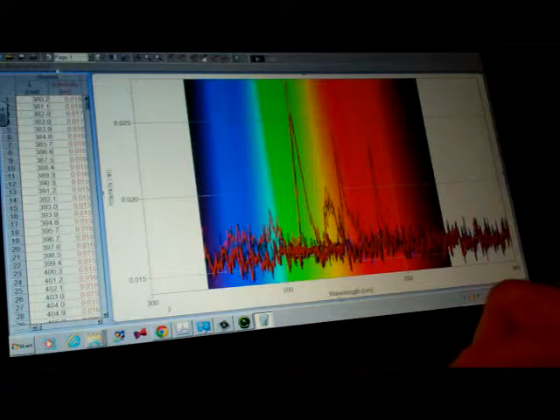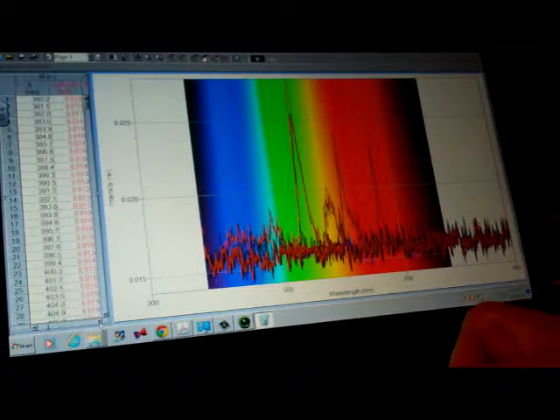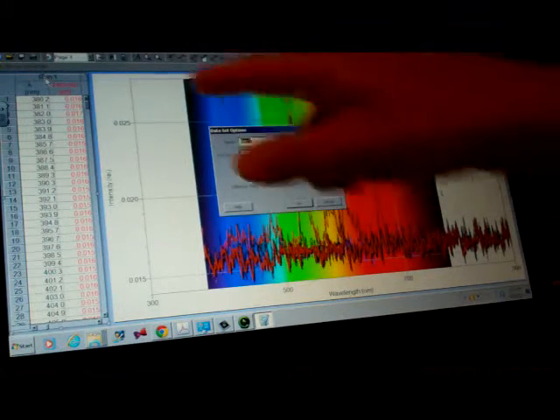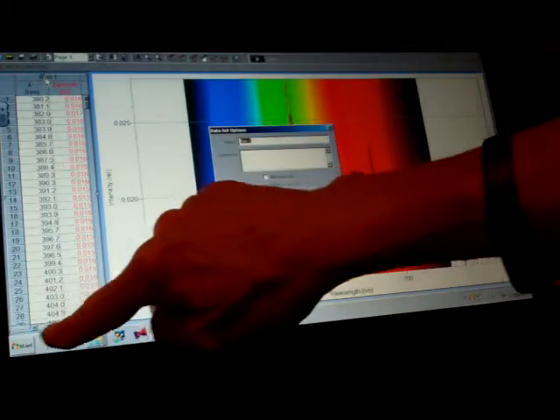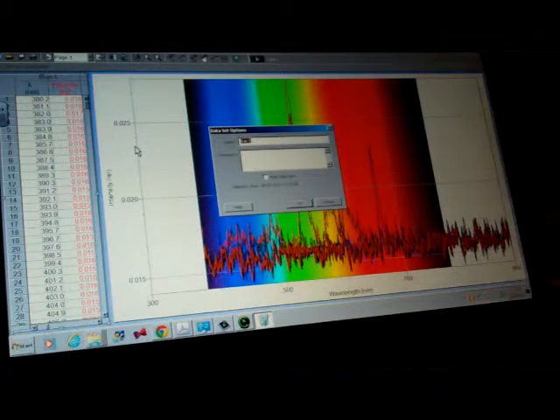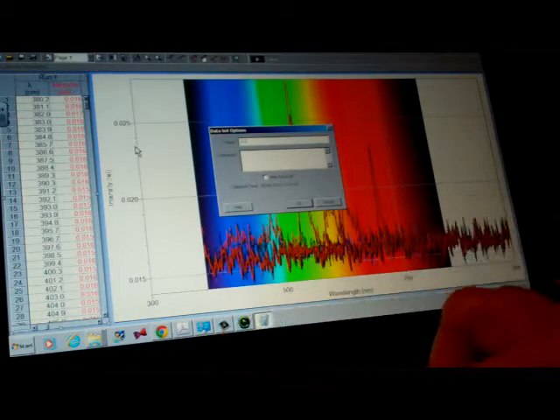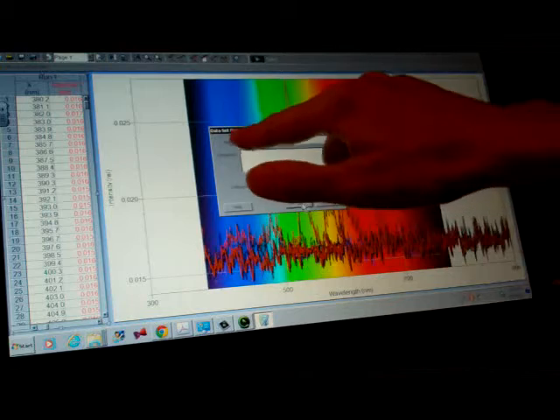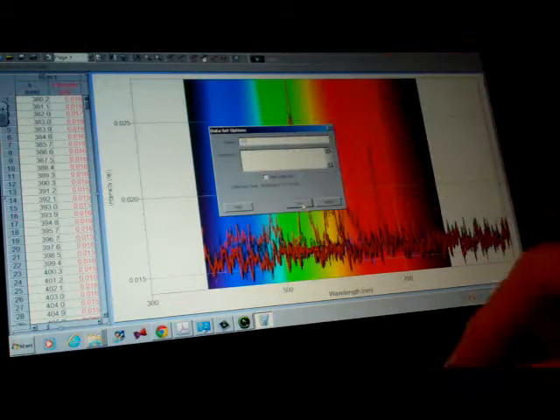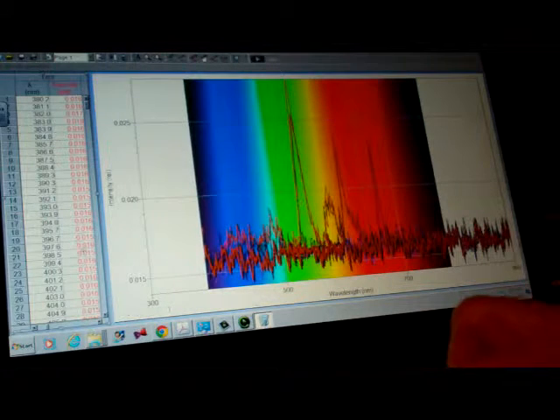And that will do for that data set. Run 1, if you recall, I arrowed over on the bottom, double click on run 1, and that was lithium chloride, LiCl. So when I double clicked under the name, type lithium and click OK.